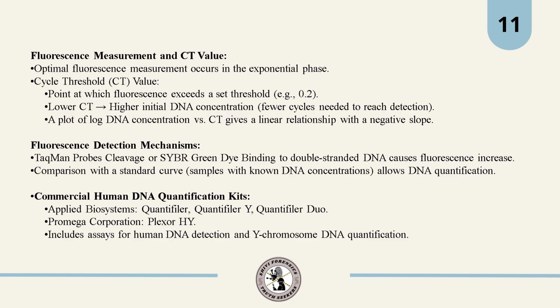This is the most commonly used method because it helps to do DNA quantification and amplification at the same time. So it is also not time consuming. It is efficient to perform it at the same time. And if our quantification is not enough, then we can increase the number of cycles and adjust it. That's why this is a method which is of high efficiency.